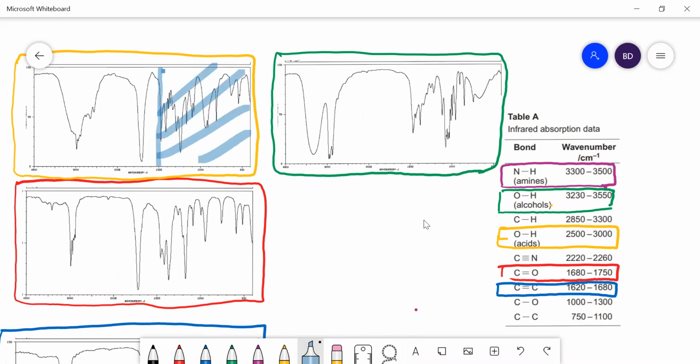That's unique to the molecule, but you don't look at that to see which bonds are there, because you can't work it out because it's too complicated. Okay, it's too kind of random. Right, so you're only really looking at half of the spectrum.